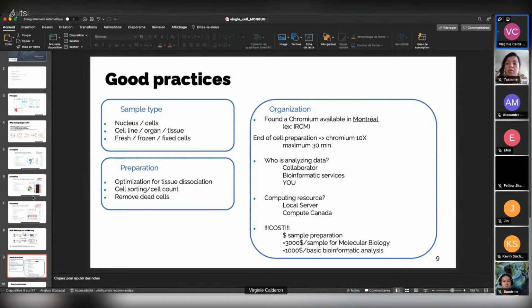Also, as a bioinformatician, if they have performed a cell sorting before the sequencing, you can check if the sorting was done well. So if they tell you which protein was targeted at the surface, you can just check at the end that this is what you get in your experiment. So again, you need to talk a lot with the biologist to know what was the experiment.